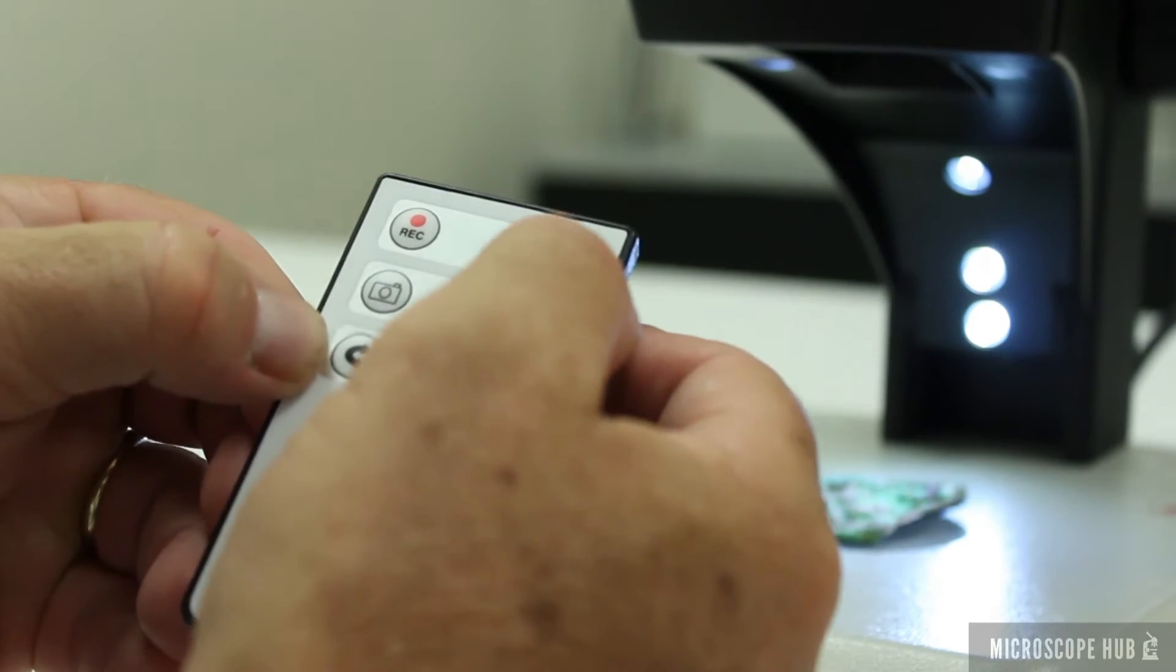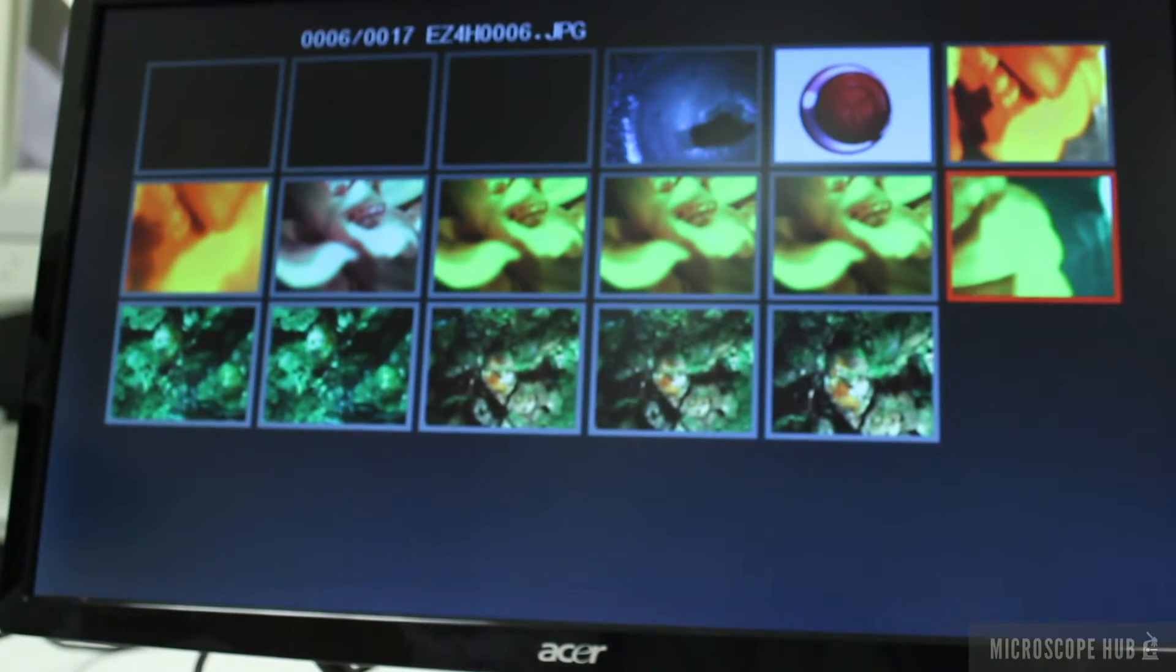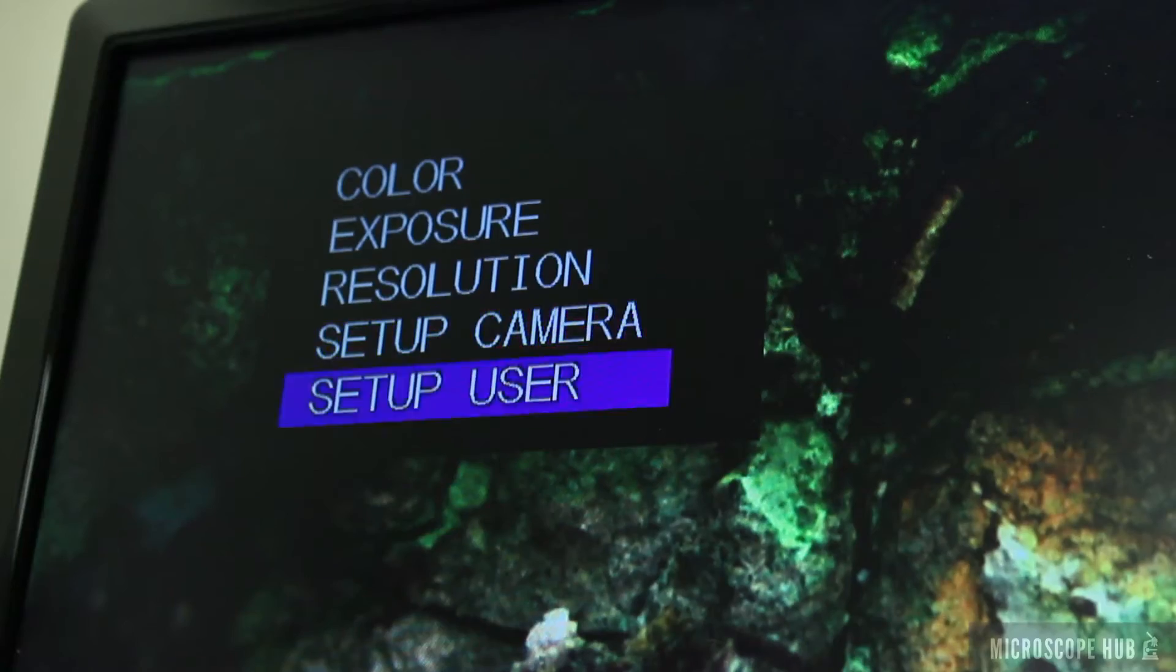The integrated remote allows for access of stored images, video capture, and setting adjustments.